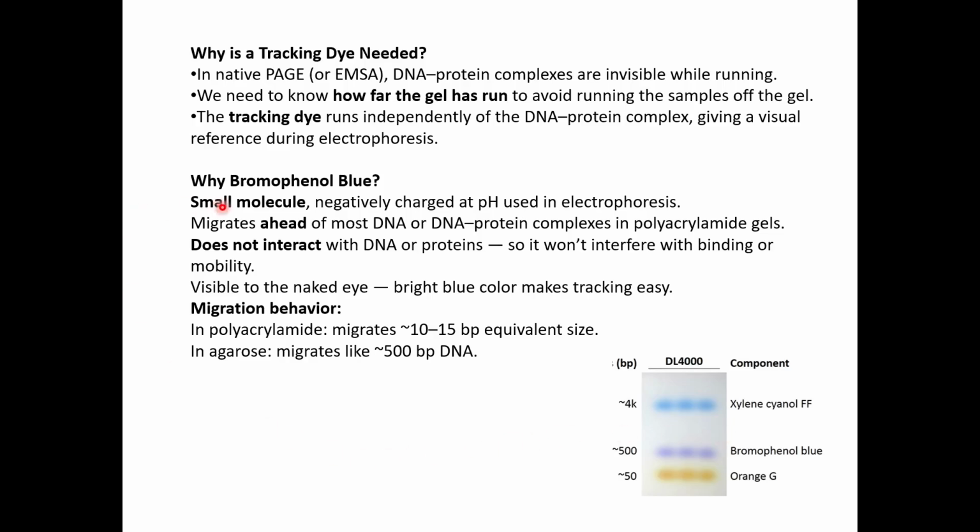So why bromophenol blue? Like I said, bromophenol blue is used very commonly in all the dyes. Because bromophenol blue is a small molecule and it is negatively charged at the pH in which we run the electrophoresis, and it migrates ahead of most of the DNA or DNA protein complexes in polyacrylamide gels, and it does not interact with DNA or protein.